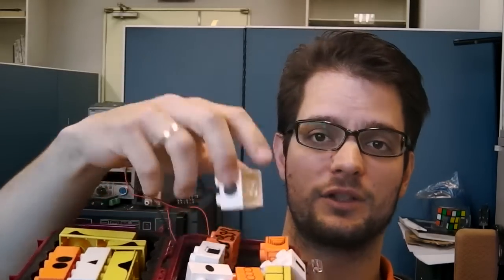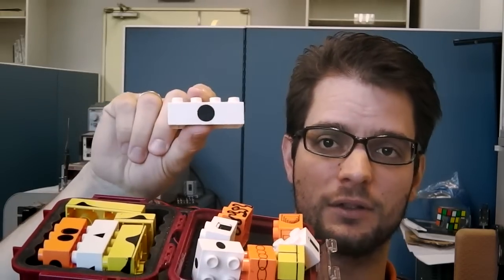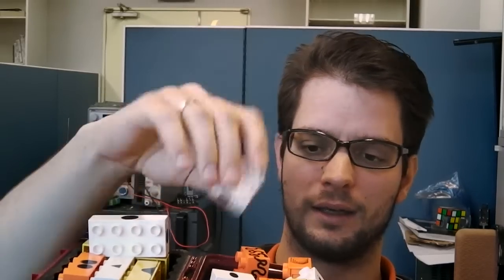Namely the shape functions, the so-called form factors. So we have here a form factor for a sphere, or we can have them for cubes, or we can have them for cylinders, and so on and so forth. Then we also have functions which describe size distributions, such as, for example, the log normal size distribution or the Gaussian size distribution.